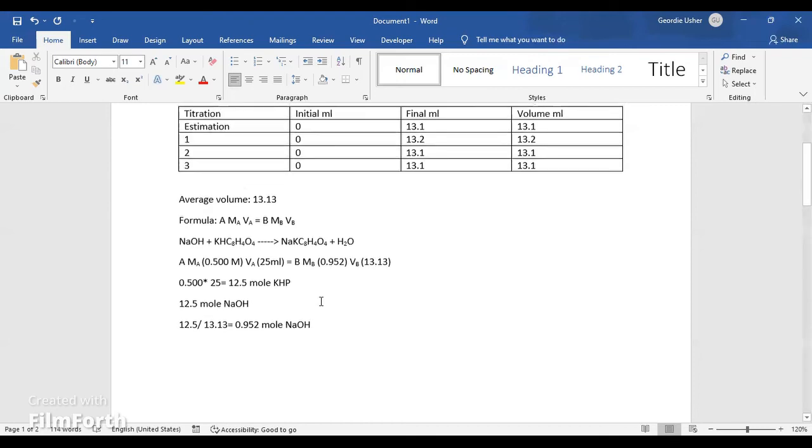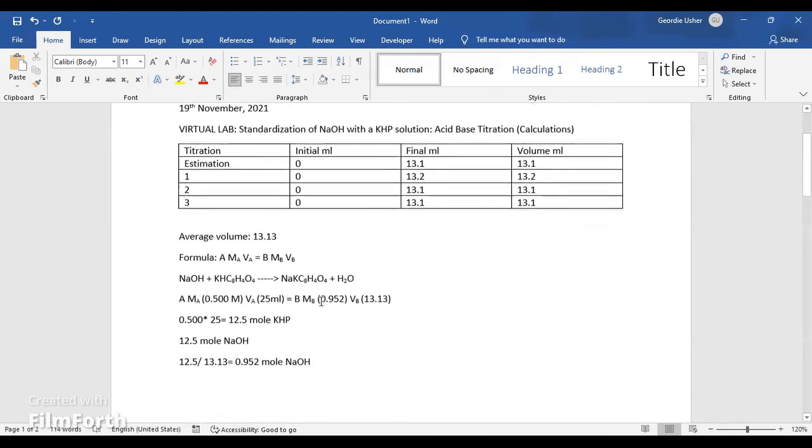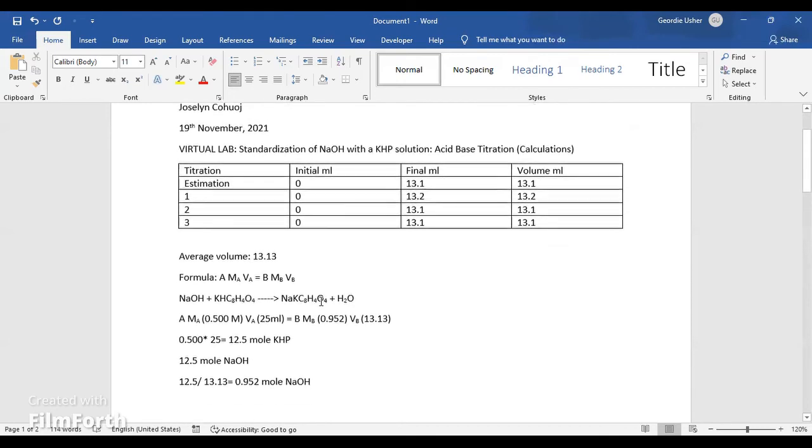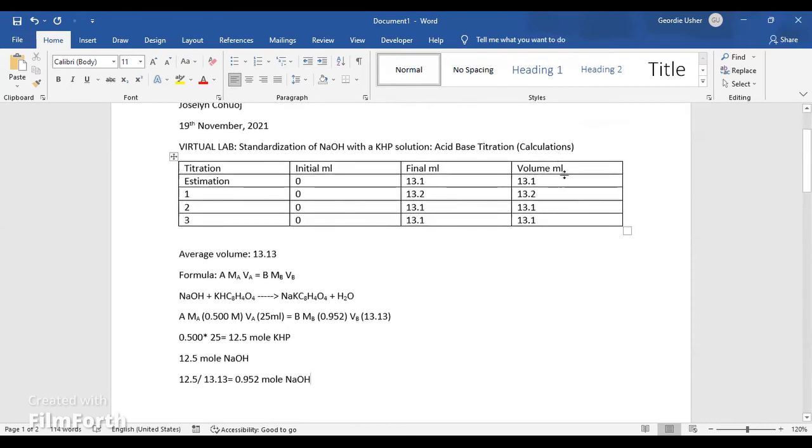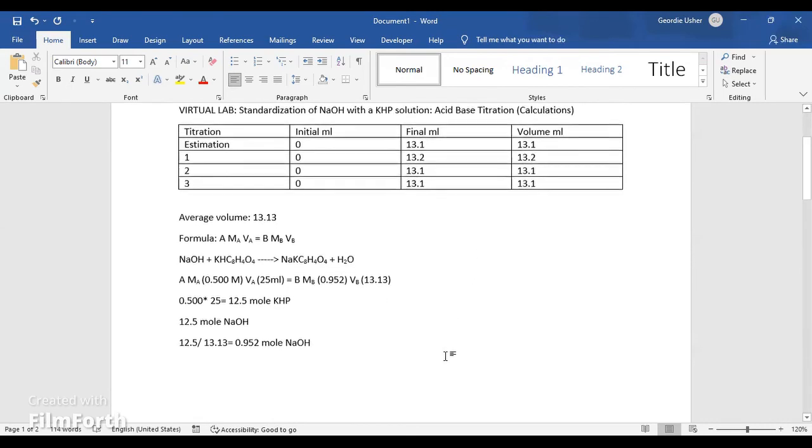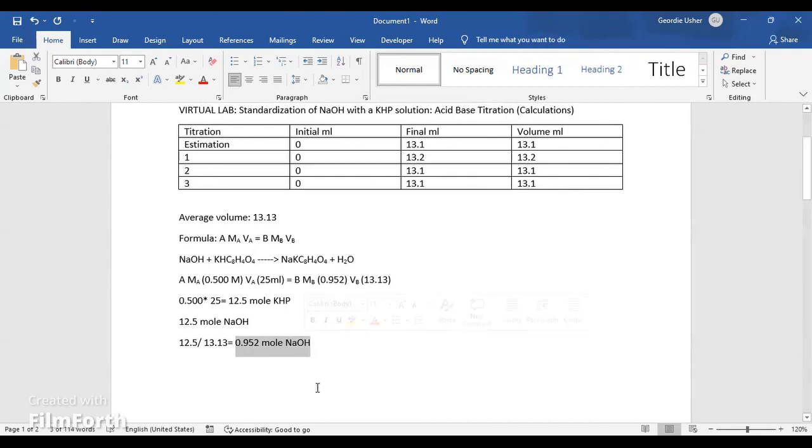So to conclude, and according to my titration results and my calculations, I can safely say that 0.952 is the concentration of NaOH.